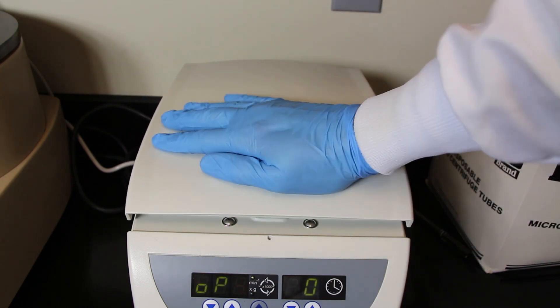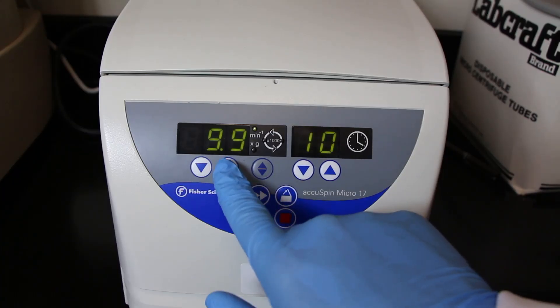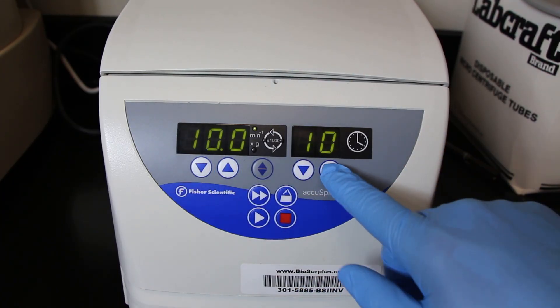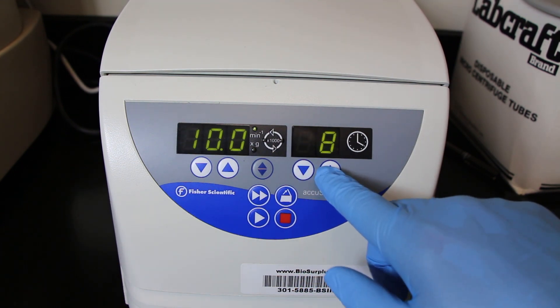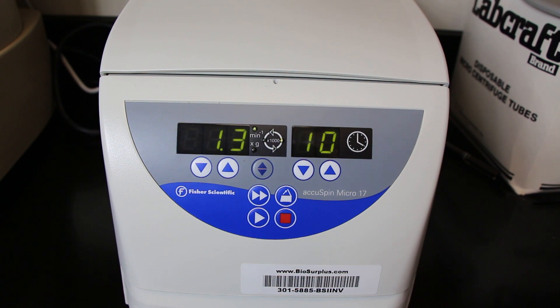Push down on the lid of the centrifuge firmly until you hear it click. Once you've done that you can then change the speed or the amount of time that the centrifuge will spin for, and just hit the play button which is what's going to initiate the spin.